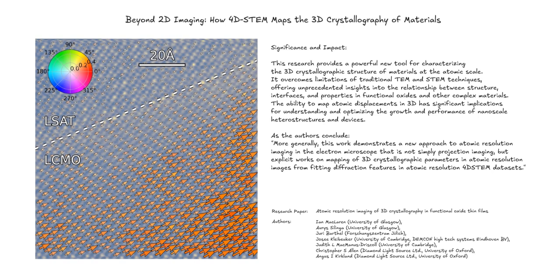So by manipulating the strain, we can essentially orchestrate the dance of these atoms within the perovskite structure, and potentially unlock hidden properties. This research truly highlights the power of combining advanced imaging techniques like 4D-STEM with a deep understanding of materials science principles. The ability to control the A-site modulation direction opens up exciting possibilities for manipulating a phenomenon known as octahedral tilting in perovskites. What is octahedral tilting and why is it important in the context of material properties?